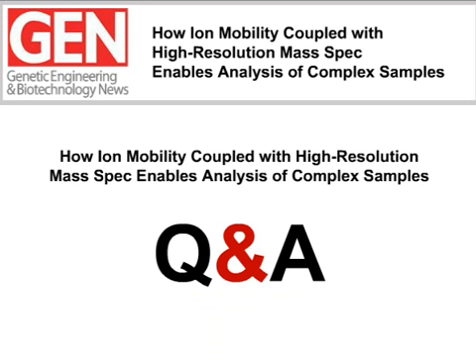If you have a lot of oxygens, they tend to form around the sodium more, so you get a big difference between the protonated and the sodiated version. But if there are not too many oxygens in your backbone, we don't see too much difference between the plus H and plus sodium version of the molecule.